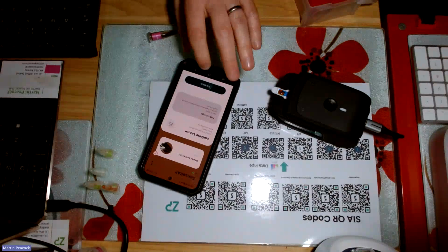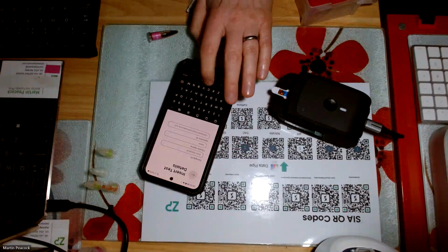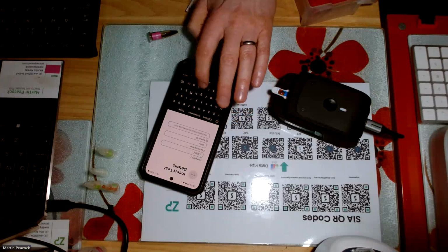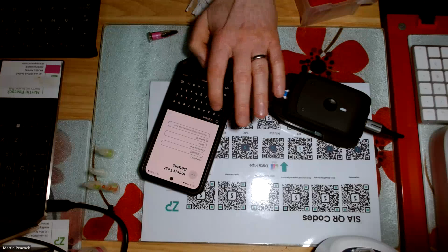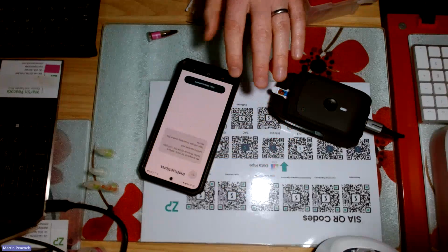Right, so I put the sample on there. I'm just going to name this actually. So let me just name this caffeine. Right, that should have done that. I'll go continue.